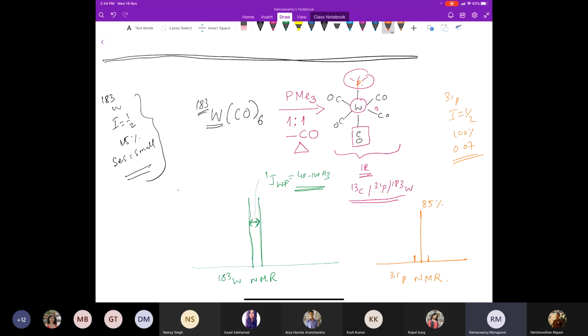So this is due to 85%. These two peaks combined together are 15%, each only 7.5%. This is significant. 7.5% is not something small like the 0.5% I talked about for carbon NMR satellites. These satellite peaks are quite significant. So you can see that it's roughly about 1:10.